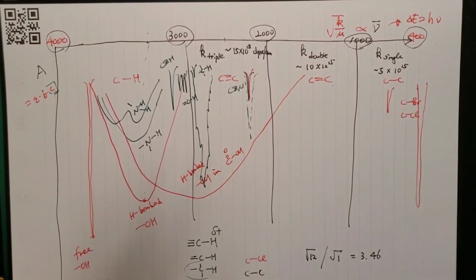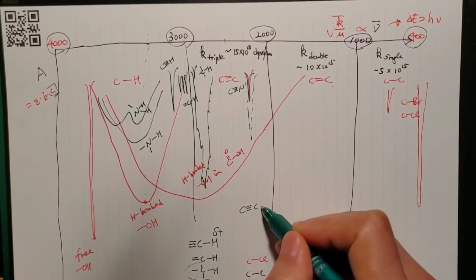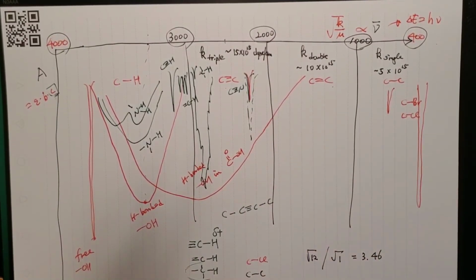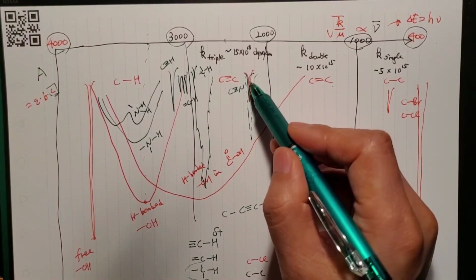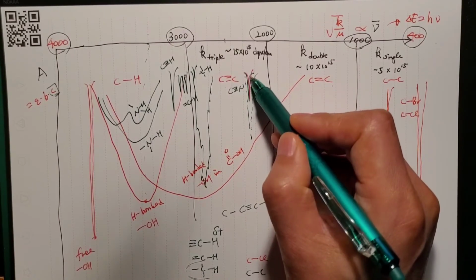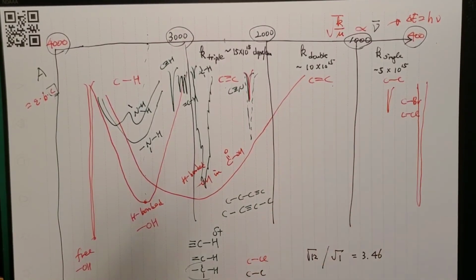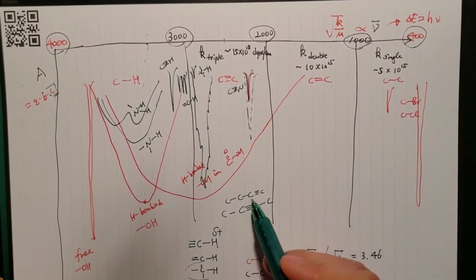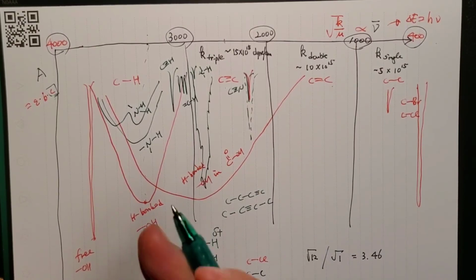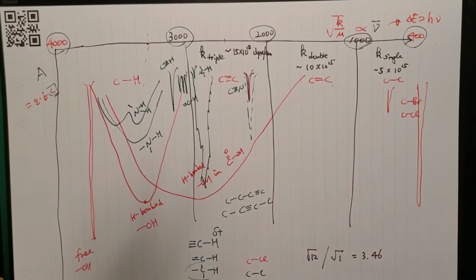And for the carbon-carbon triple bond, if the molecule is symmetric like this, with the same structure on both sides, then the dipole moments cancel, so the molecule becomes nonpolar, the molecular dipole moment becomes smaller, and then the peak becomes smaller. If you put the triple bond at the terminal, then it's not symmetrical, so the triple bond tends to give a somewhat more intense signal. This way you get more detailed information about the structure, whether the triple bond is in the center or at the terminal.